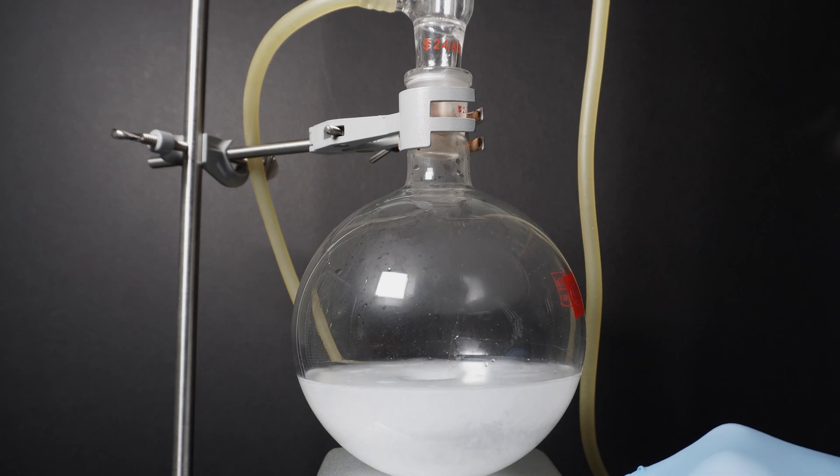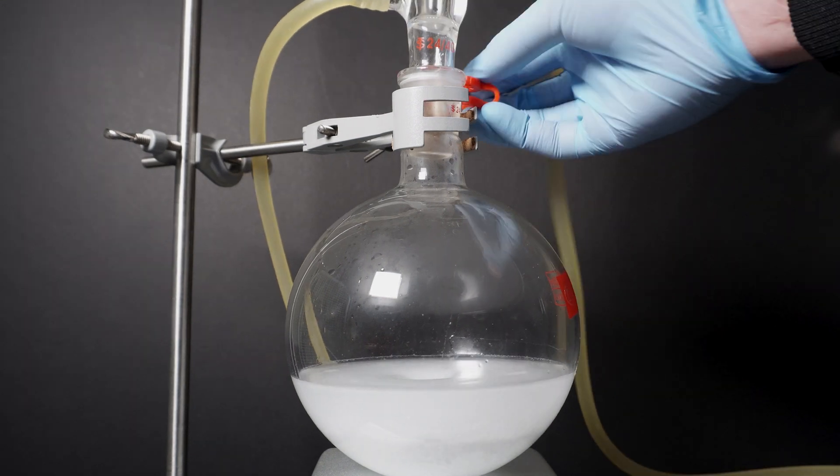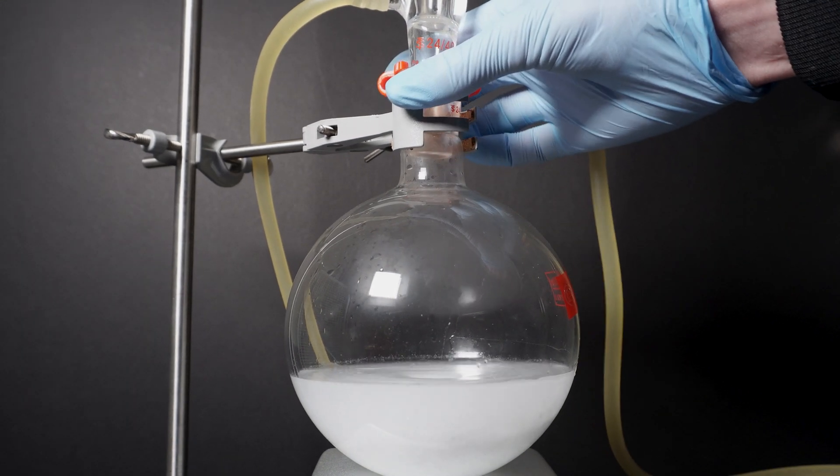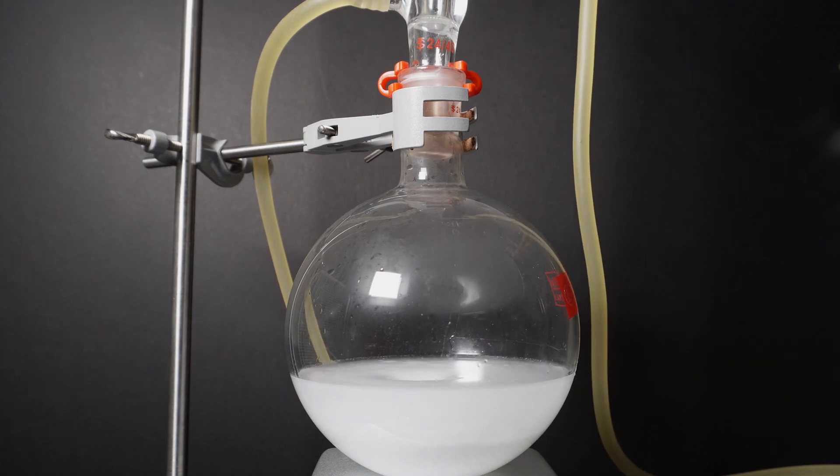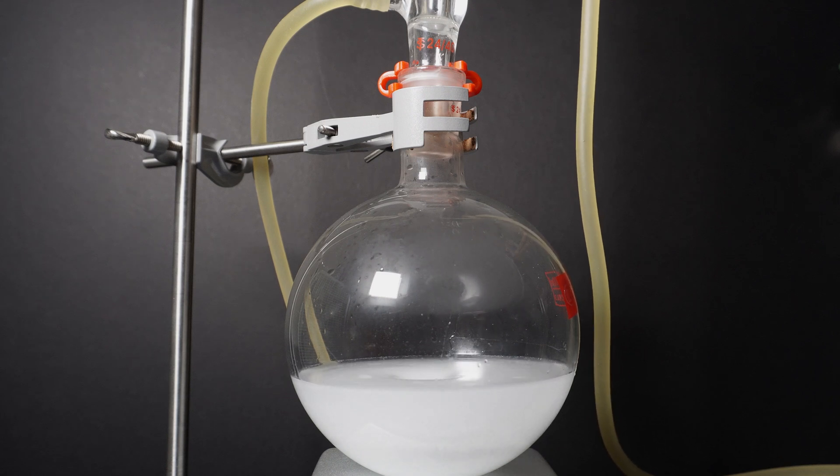This method can also be scaled up and I actually scaled it down for the purposes of this video. After this I add a cold water condenser on top, turn on stirring, and attach a plastic clip between my condenser and my flask for safety. Then I turn on my hot plate to medium heat.